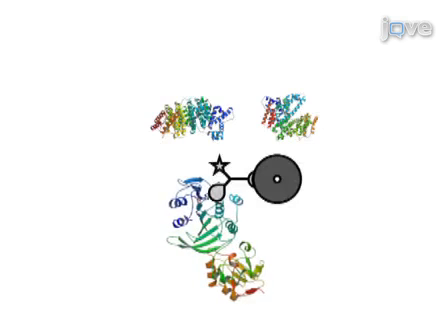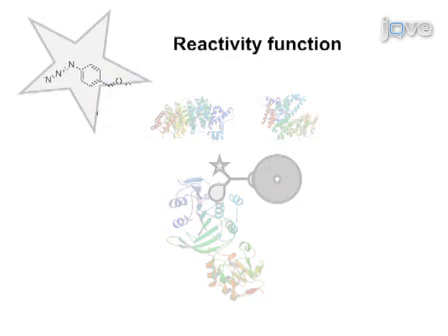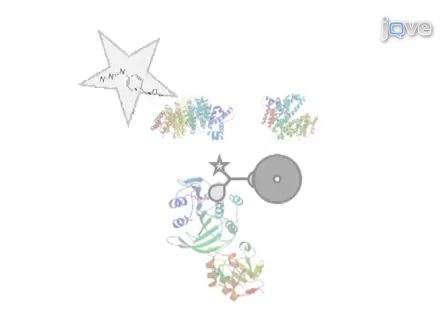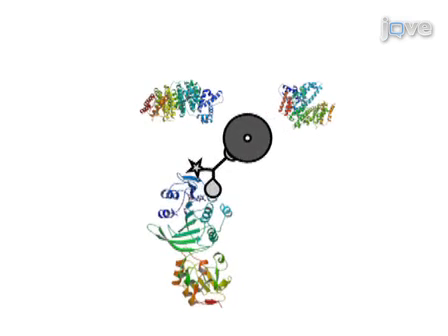As a second step, the mixture is irradiated by UV light within the capro box. The irradiation photoactivates the reactivity function of the capture compound. This induces the formation of an irreversible covalent crosslink between the capture compound and the target proteins.